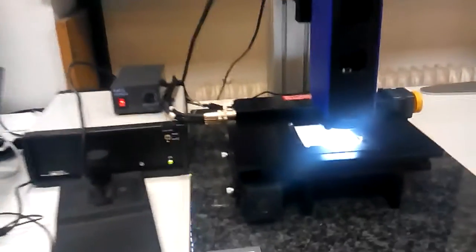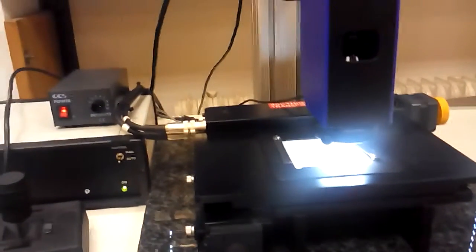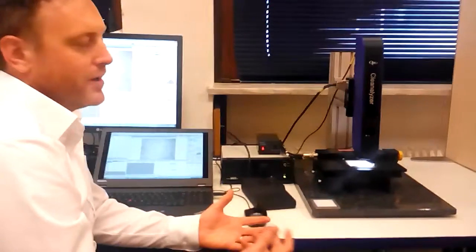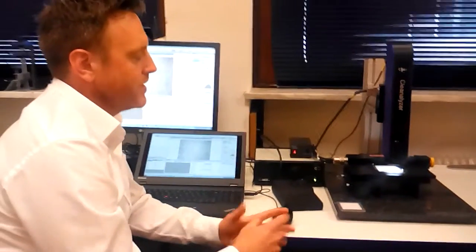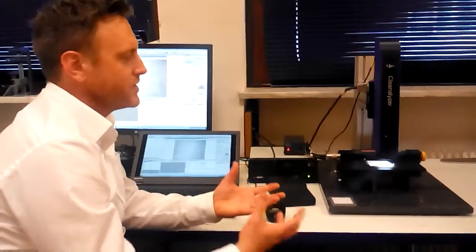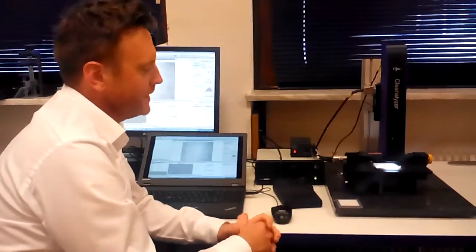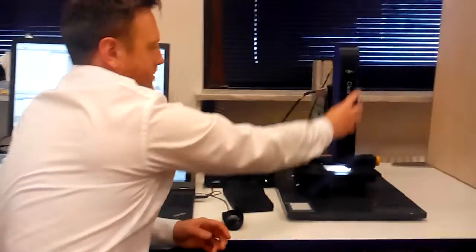One of the key factors in residual dirt analysis is the overall resolution of the system, that it is able to resolve typically down to particles of 5 microns in size. So balancing the optical design with the camera chip size is a very critical factor which we've resolved very carefully here. So we have the video system here.